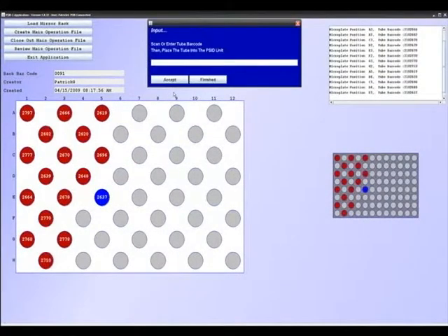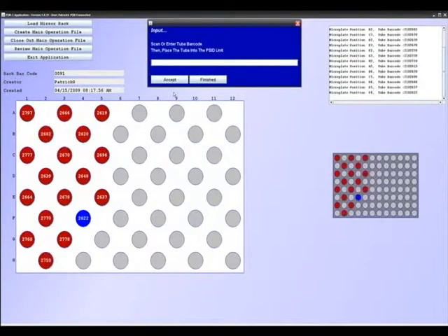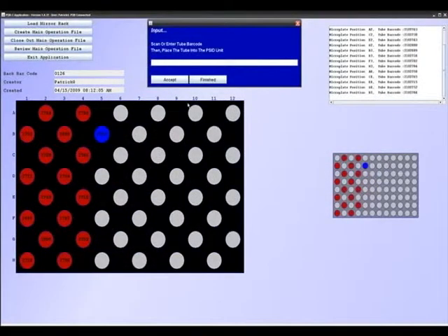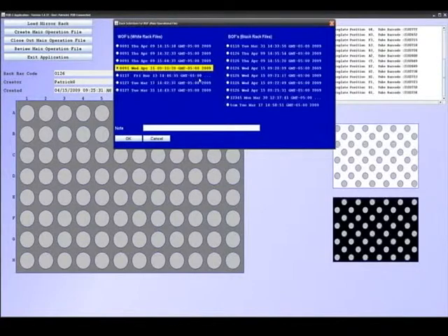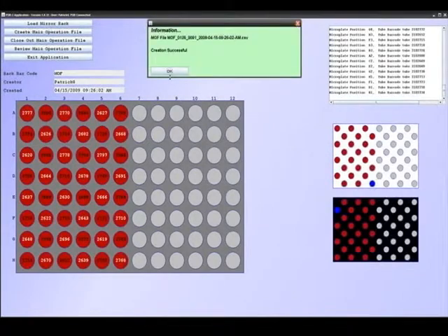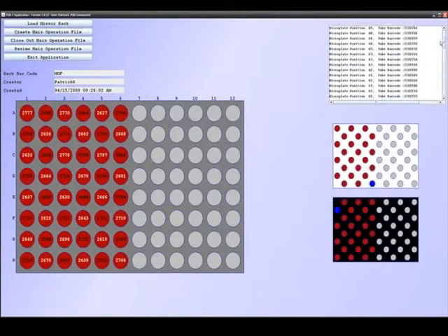Position files are created for both black and white mirror racks. White operating files, WOF, and black operating files, BOF, are created. One of each is then combined into the main operating file. The main operating file, MOF, is identified by the barcode of the final 96-well processing plate. Partial or complete plate files may be created.